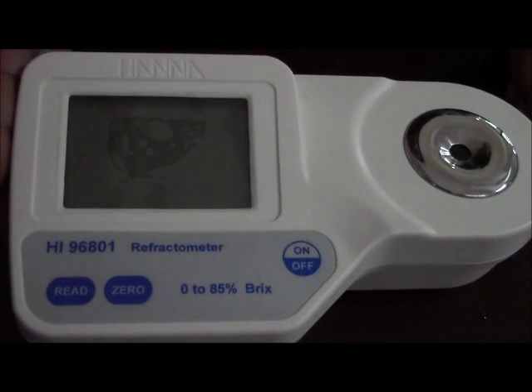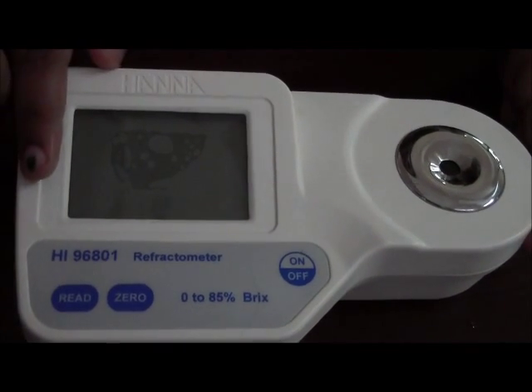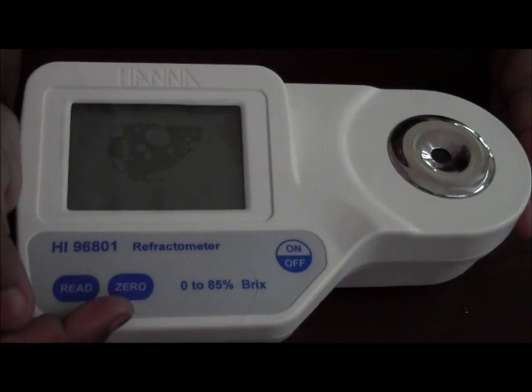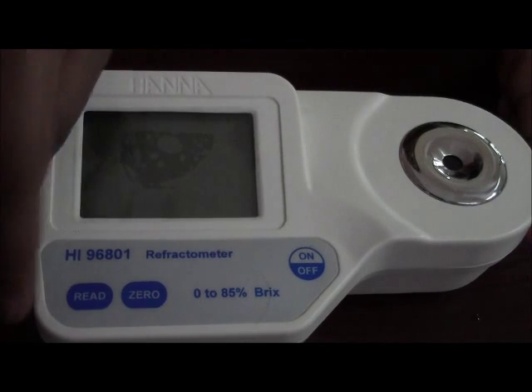This is the HANA HI96801 Refractometer. This is its LCD display. This is the read button to read your sample. This is the zero button to calibrate your meter. This is your on/off button.